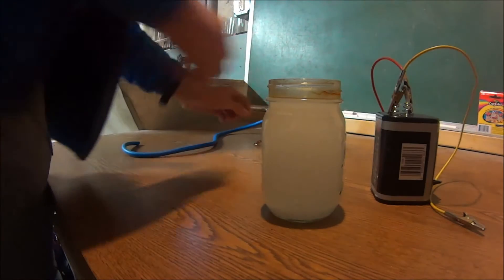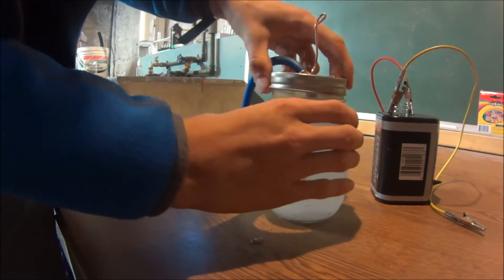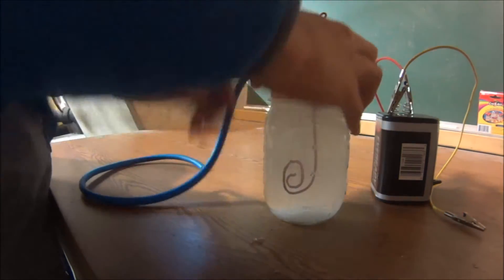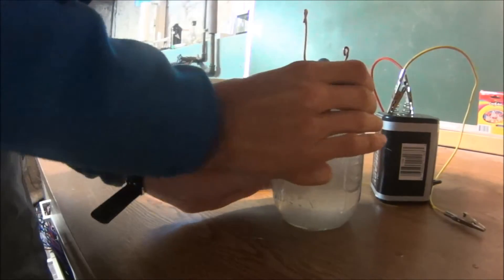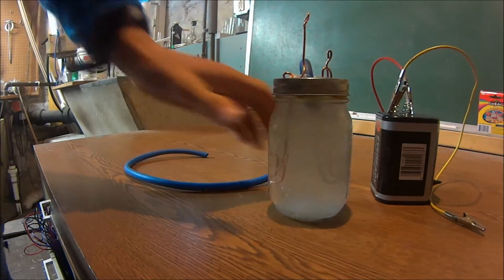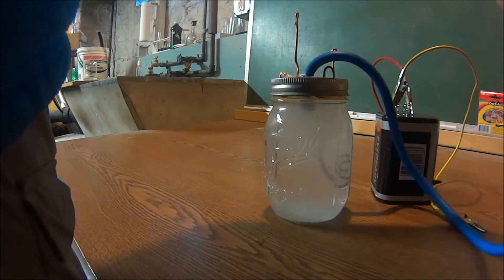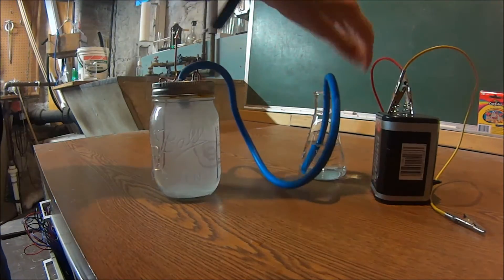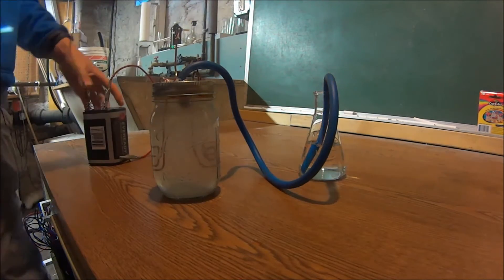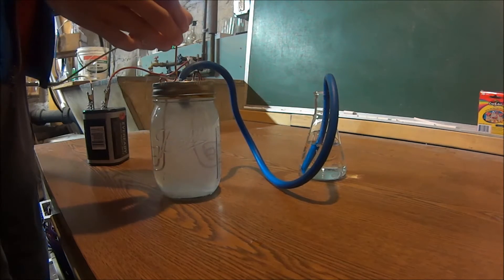Now we put in our copper electrodes. I'm using copper because it's easy to use. Let's get it in here - make sure you want to have a good seal. Now you can actually start to see through it because some of the salt has gone into the solution. So we're going to make our little bubbler, right here - we have our bubbler. I'm just using a 6 volt lantern battery. You don't need to do that, it's just I have a potential of losing power.